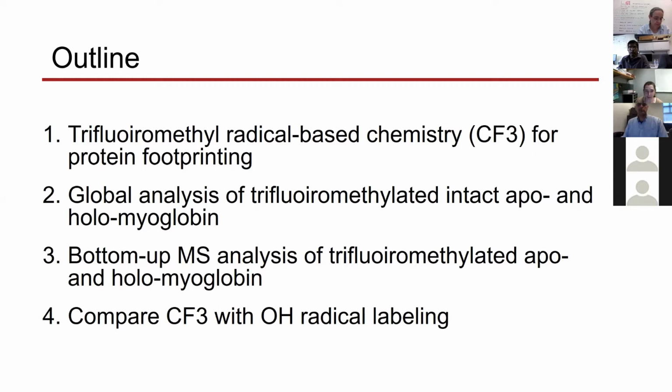Then I'll show you some experiments which we used to test the CF3 and develop this technique for the synchrotron platform, and I'm going to show you data on a global intact protein, and also trifluoromethylation of the protein using the bottom-up technique, which is conventional for a typical footprinting study. I will also show you the comparison between CF3 and hydroxyl radical labeling, so you have an idea when you can use one or the other chemistry.